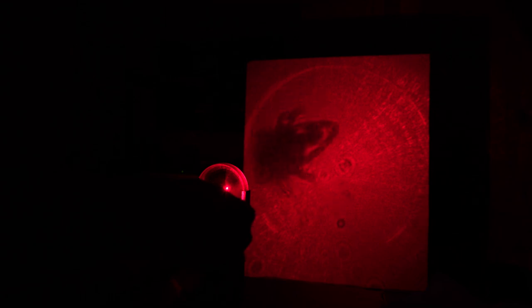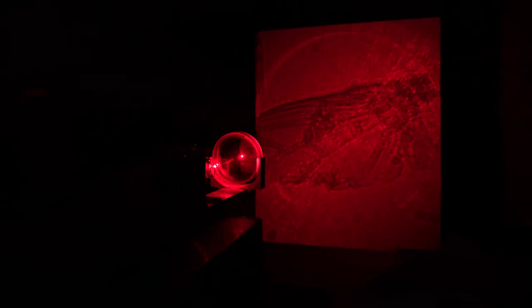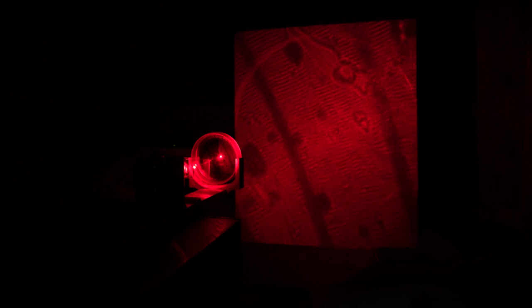Let's see what critters we can see. Insect wings work well too. Here's a fly wing, which is relatively clear. And a butterfly wing with the scales wiped off.